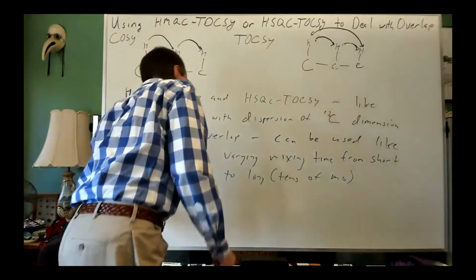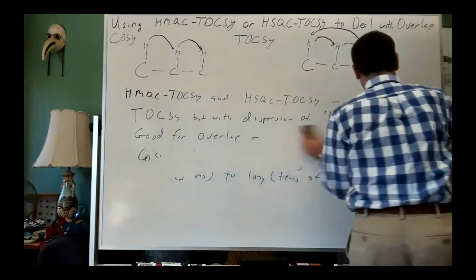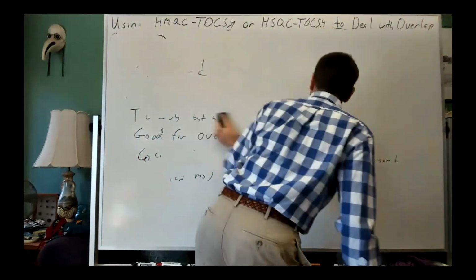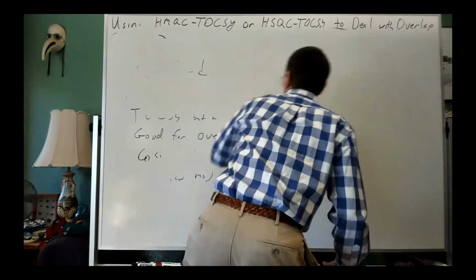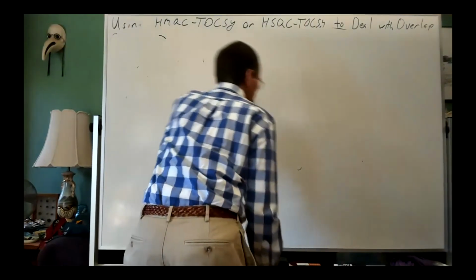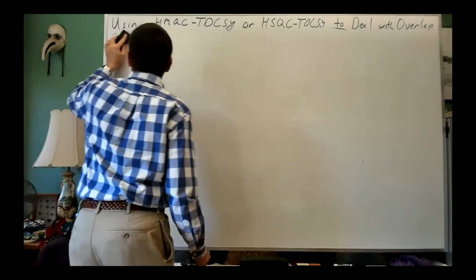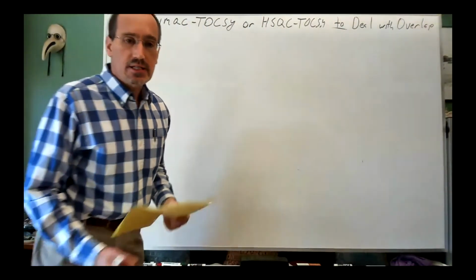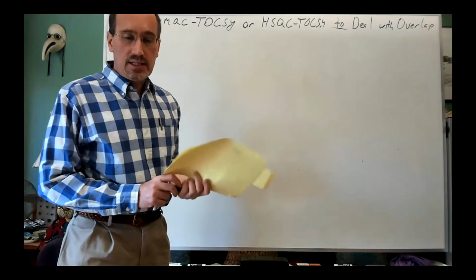So the question that was asked very aptly was, what's the difference between HMBC and HSQC TOCSY?